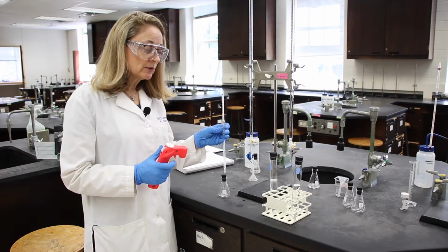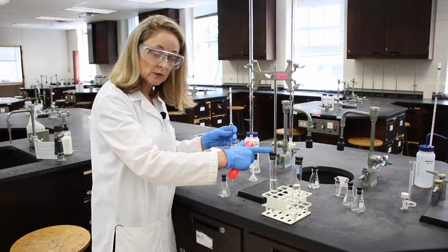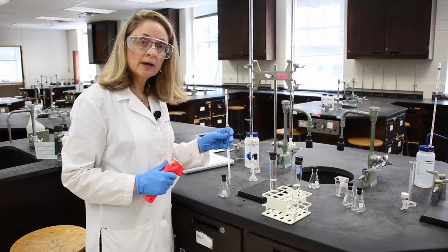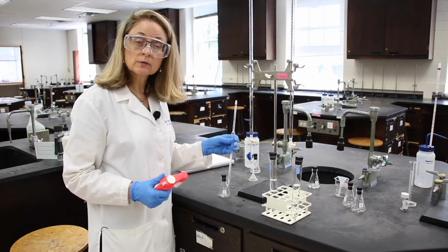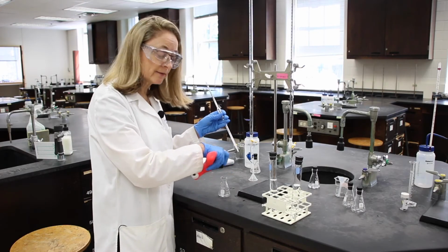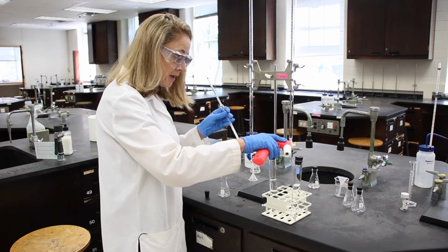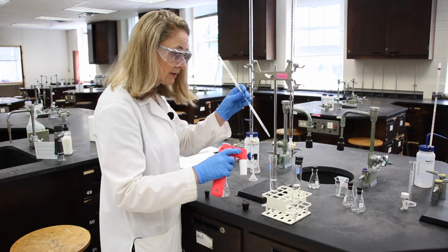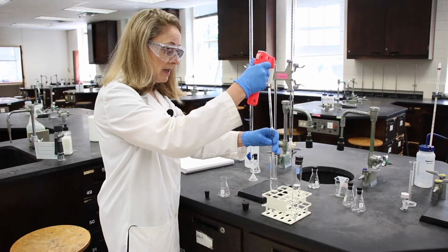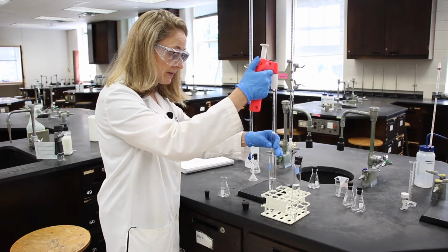We now have to normalize our pipette with the first solution that we'll be using, and then I'll pipette a 10 milliliter aliquot, or a sample, into my flask, and then I'll reweigh the flask, stopper, and sample. So first, I will normalize this pipette, and again, that's just coating the inside surface.